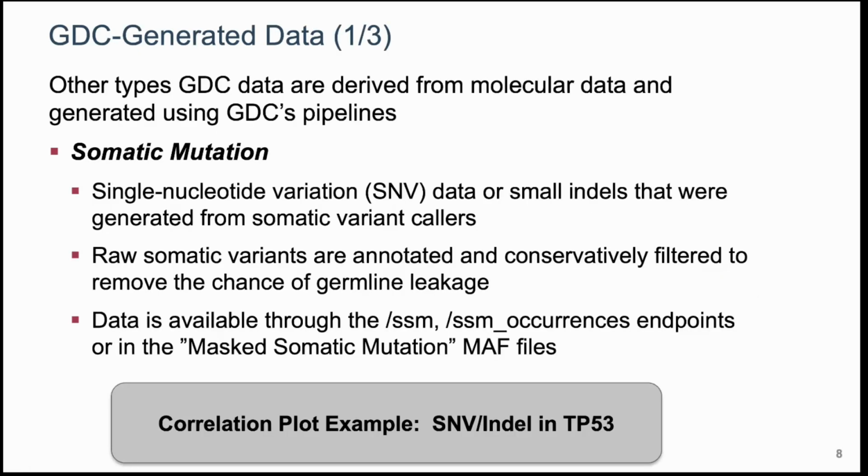So next, let's talk about the GDC generated data. The data that's not pulled directly from submitters or provided to us directly by submitters is data that was derived from molecular data and generated using the GDC's pipelines.